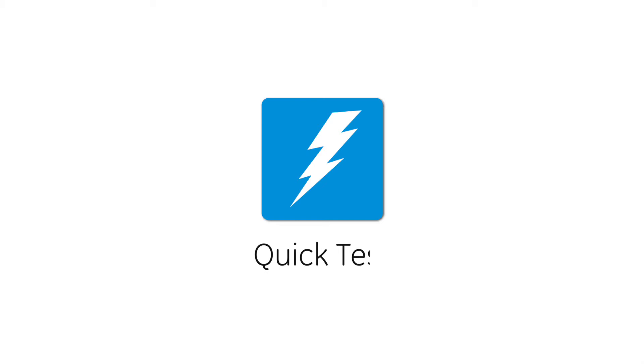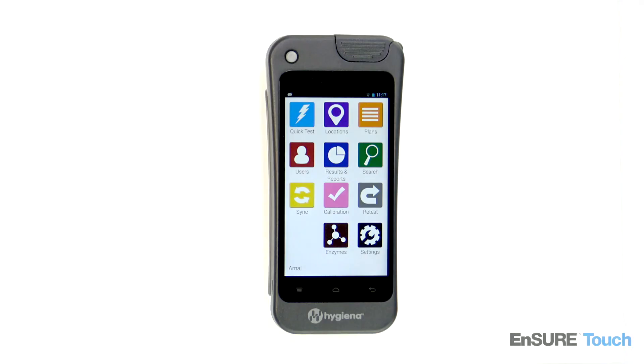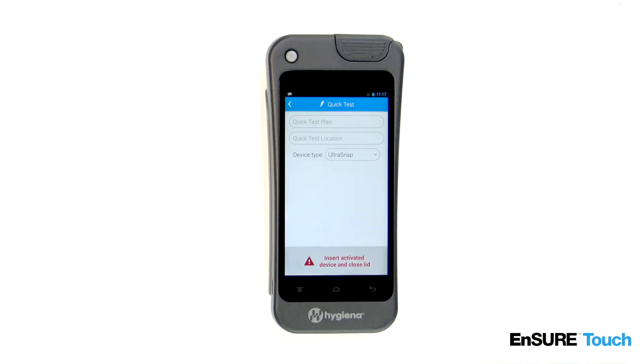Welcome to Hygiena's instructional video on running a quick test on the InsureTouch. Quick test is perfect for testing on the fly outside of normal testing plans. We recommend filling out all the fields so that you can track the plan and location name of the test, however, this is optional.